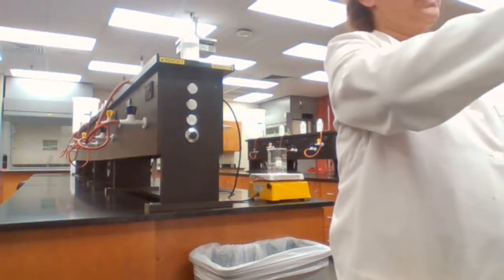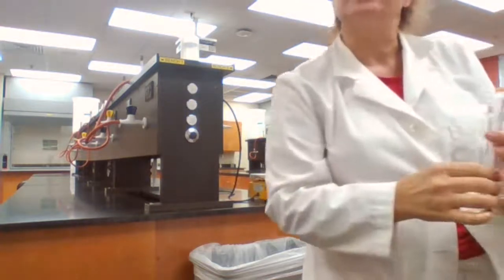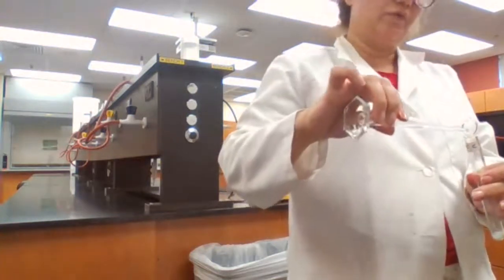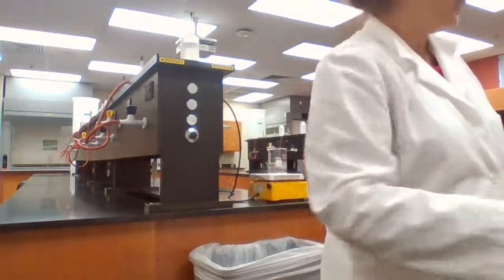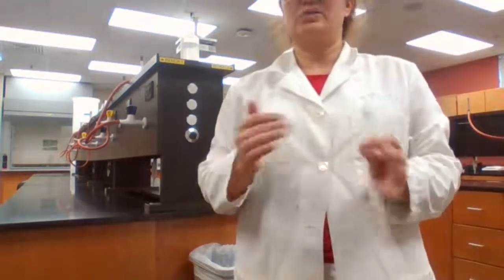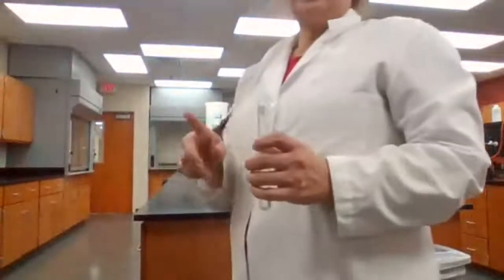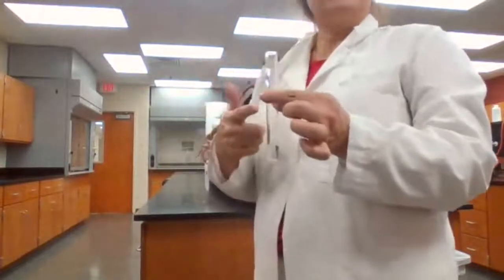We do need a catalyst for this reaction. It doesn't happen on its own. We do need a catalyst. What is the catalyst that we are using here? 8 drops of sulfuric acid, and the drops of sulfuric acid are used as the catalyst for the reaction. A catalyst is added to the reactant to increase the rate of the reaction or make the reaction happen faster. The sulfuric acid is inside the fume hood, so I'm going to take the test tube to the fume hood, use my gloves, and add the 8 drops, and I'll be right back.